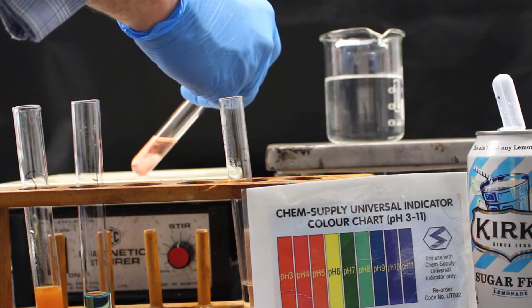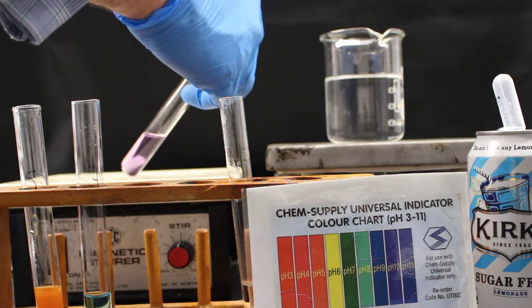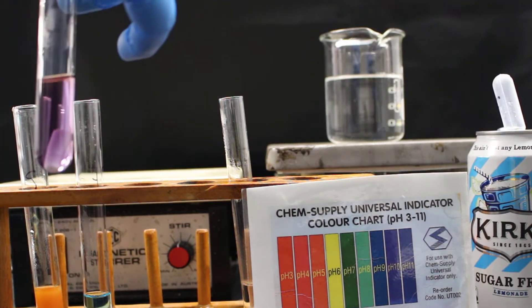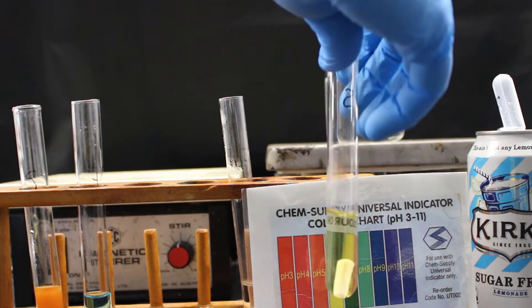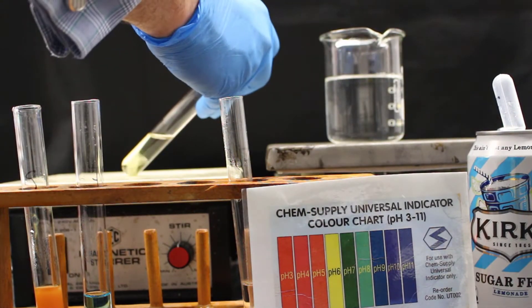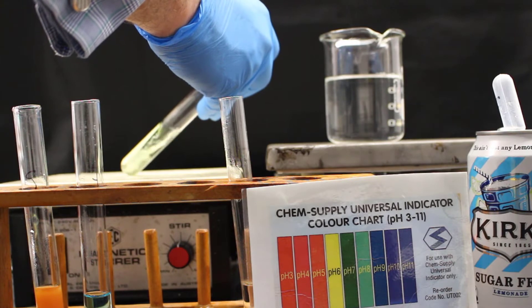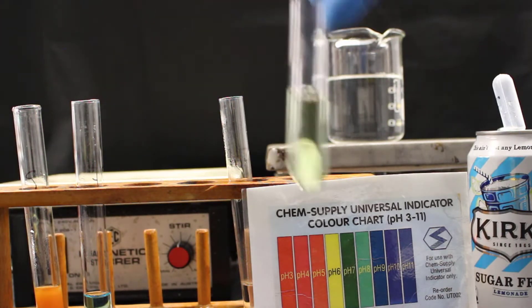We're aiming to change the color of the indicator from the red color, which indicates an acid to green, which indicates that it's a neutral. And it's a matter of just going back and forth, checking the color until we've got green.